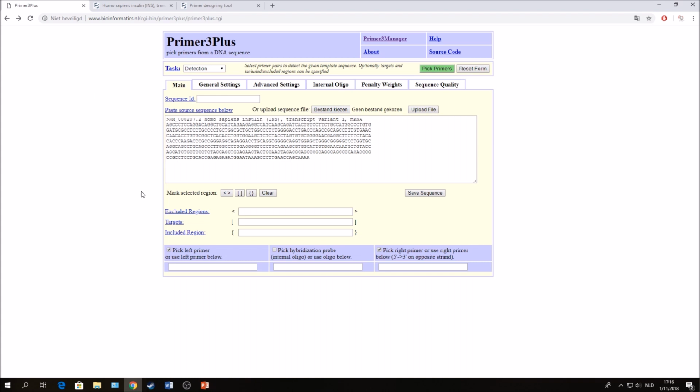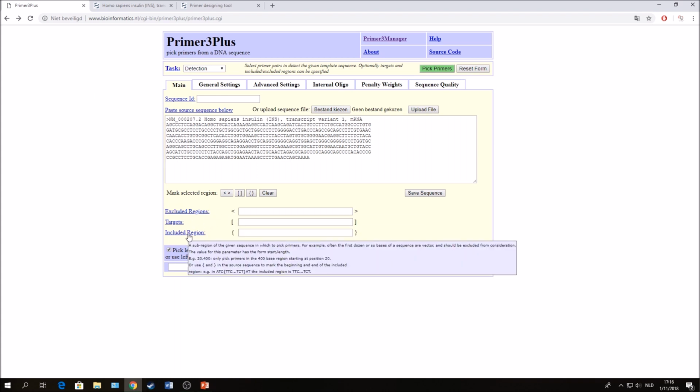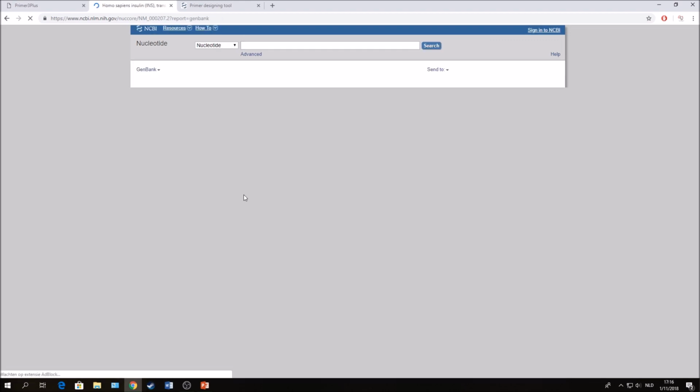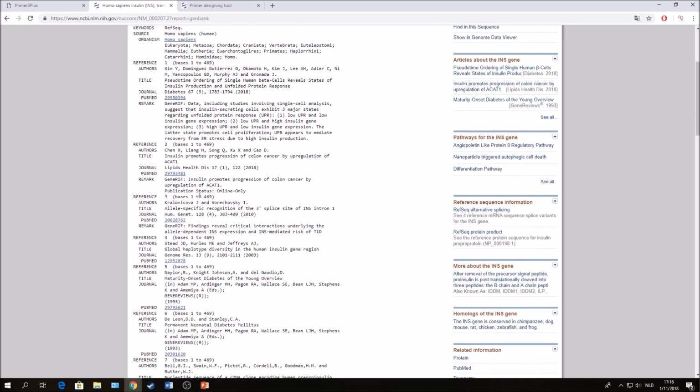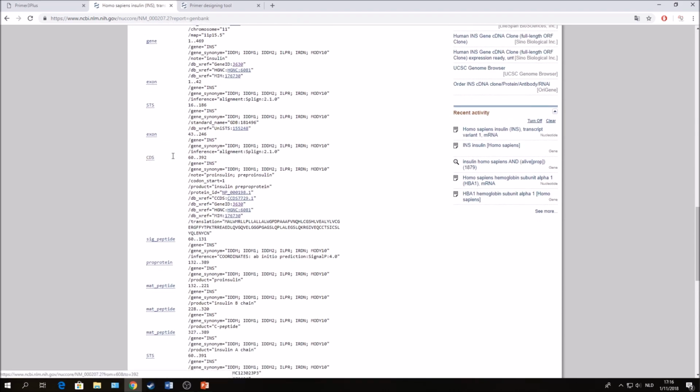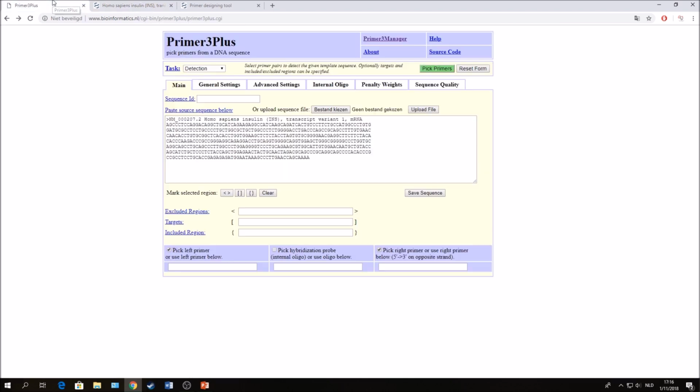So then we go back. So let's test these markers. So let's say by example that we want to isolate our coding sequence. So we go down here and we see that our coding sequence goes from 60 to 392. So how we insert this, we go to target because we want the entire coding sequence.